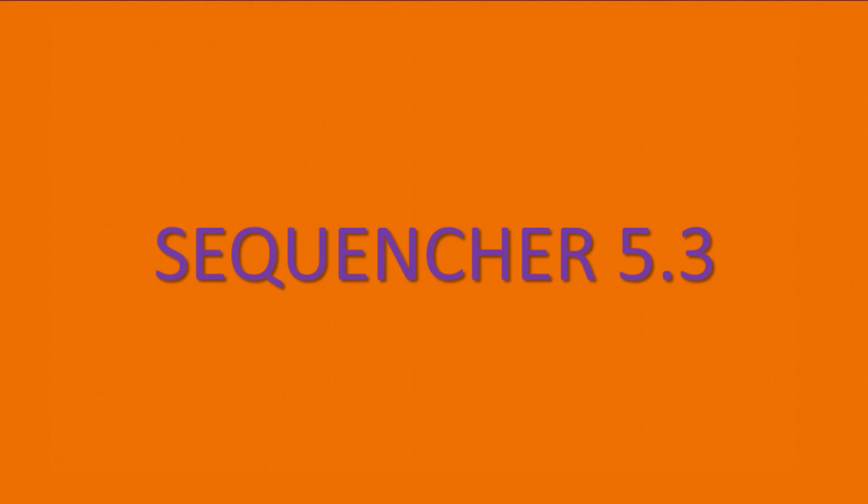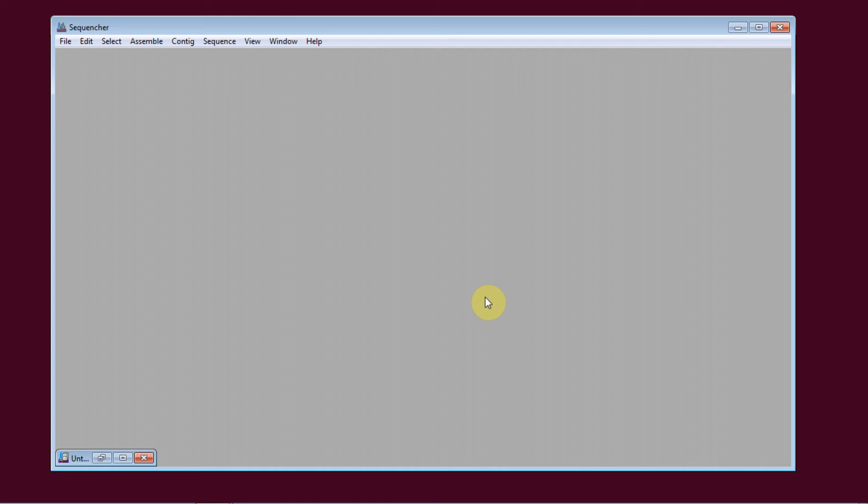Today, I'm going to show you some of the new features in Sequenture 5.3. The biggest addition is the CuffLinks suite for RNA-seq analysis, including differential expression.